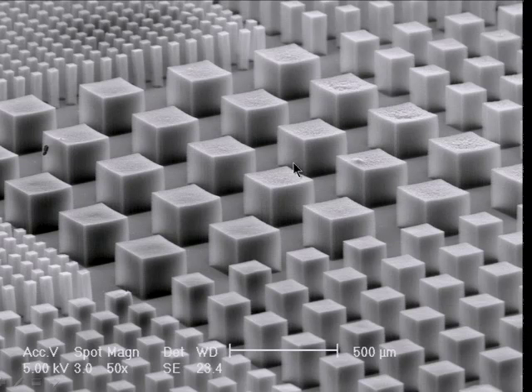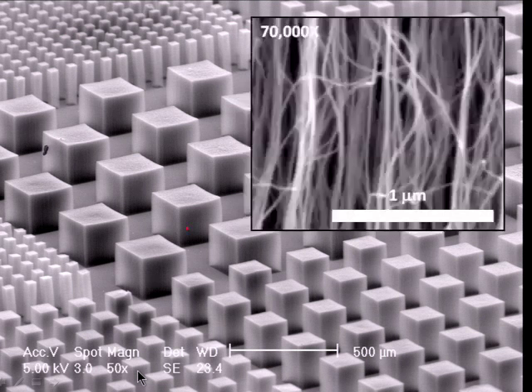You could take an image with this magnification, 50x, using an optical microscope, but you wouldn't have the type of resolution of the texture and also the depth of field. To me, that's also one of the useful aspects of an SEM, that you get a fairly large depth of field. Everything in here, to a certain extent, looks pretty much in focus, although this is tilted at about 45 degrees, and we're looking deep across it. It was expressed on the previous slide with the specifications. We can go down to nanometers, and this is a picture of the forest as you zoom in.